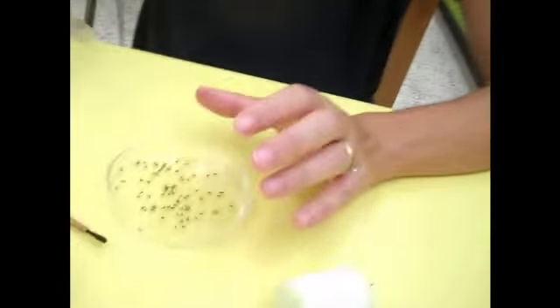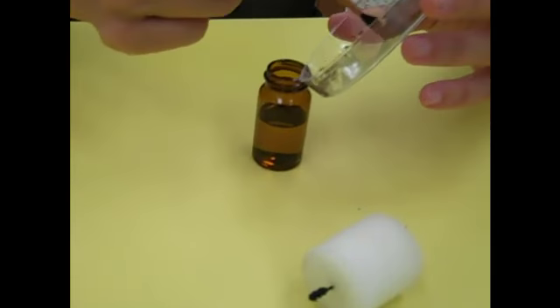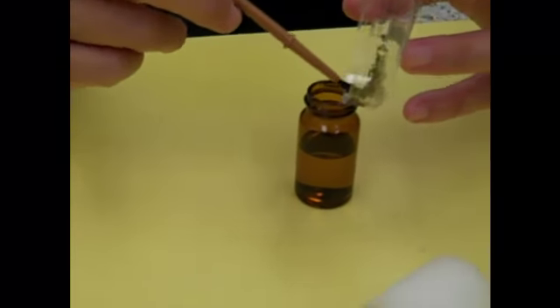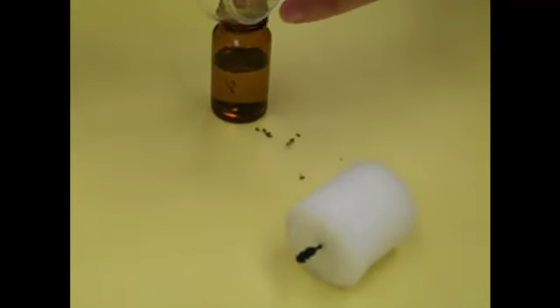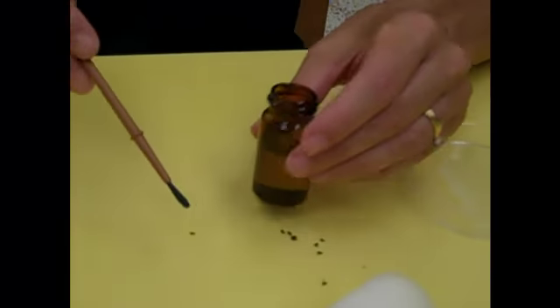At any rate, you can observe them, and when you're done with them, assuming you don't need them for some purpose, you might need to cross them with something, but since these are not virgin females, we wouldn't want to cross them. You do, generally speaking, kill laboratory fruit flies, and the way you do that is you drop them in alcohol. Each group will have an alcohol vial, and you will just put any unneeded flies into the vial, and that's also called putting them in the morgue, and they are killed by doing that.